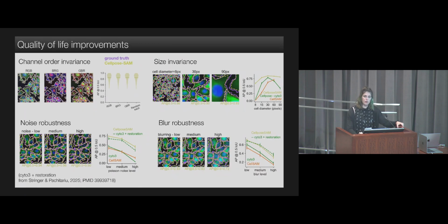Additionally, we trained it for robustness on other degradation cases, like blurring. You can see Cellpose-SAM performing as well as our restoration models with the previous model applied. And this also works for anisotropic images. This is useful, we're already applying it in 3D data, and that seems to be quite useful, and pixel size robustness too, like downsampling and upsampling.